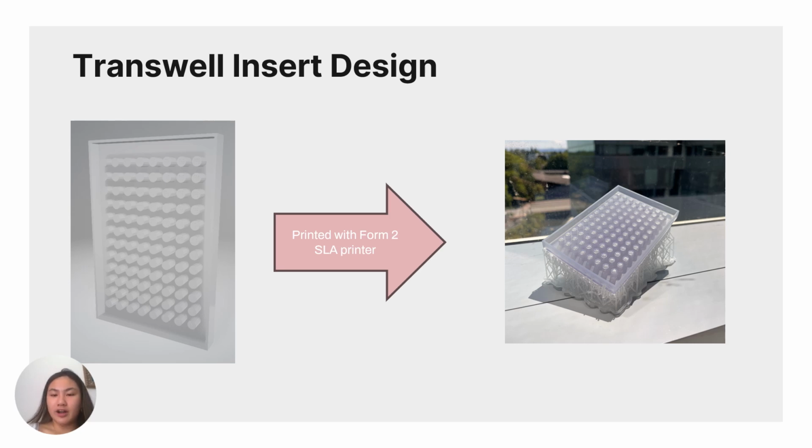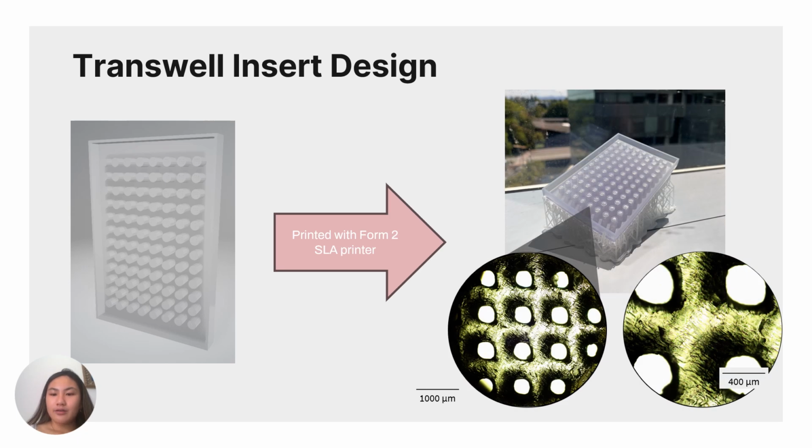And so this is a picture of one of our prototype prints, one of our first prints that was successful. And the resolution of an SLA printer is quite clear. So you can see that these holes can get up to 400 microns in diameter.